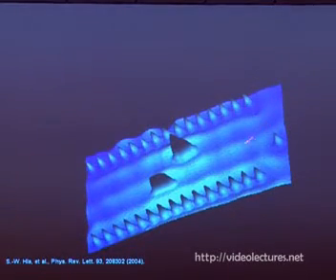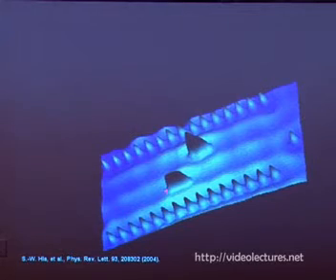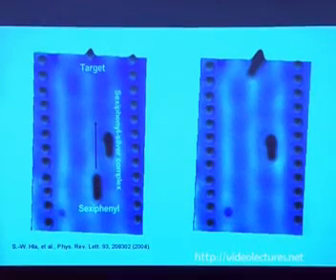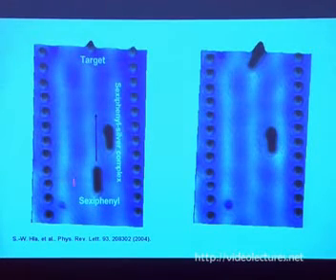The atom is gone, and the molecule bounced back here, and the molecule has changed shape. The atom is incorporated into the molecule. This molecule is moved here for a comparison. So this is how the molecule takes the atoms by bending the pi rings. We can also shoot not necessarily at the lower part of the standing waves. We can also shoot on the higher part.